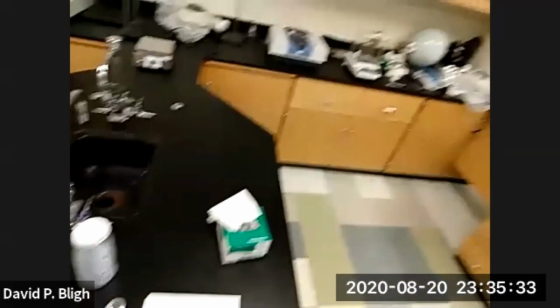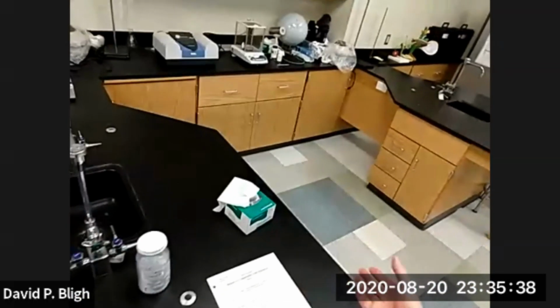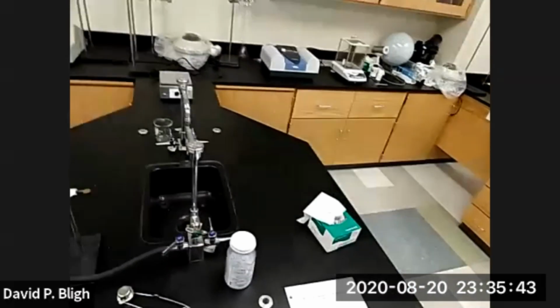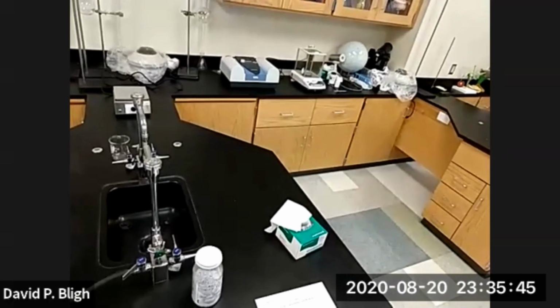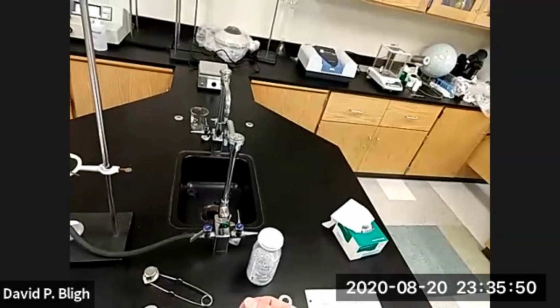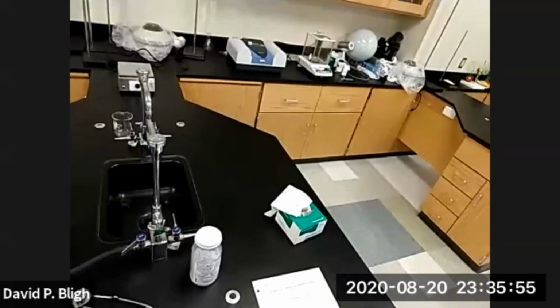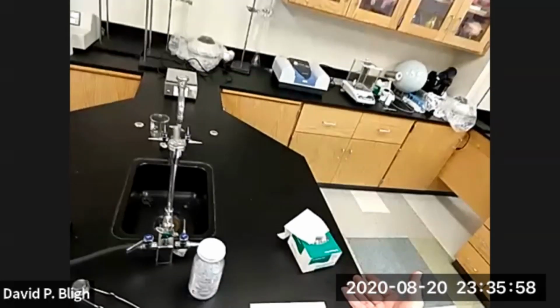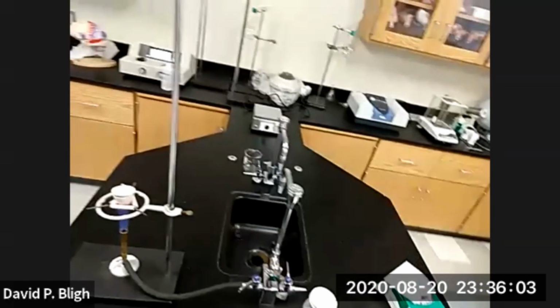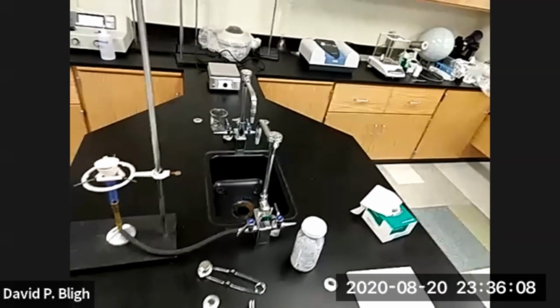Now, why don't I measure out that material while I'm waiting into, say, some other container, and then just transfer it into the crucible when I'm ready? Well, the problem is, once you get through heating your crucible and cooling it down, how are you going to separate that material from the crucible to accurately measure it? Because we measured it in some other container before, that just adds potential places for error. You want to minimize error all that you possibly can.